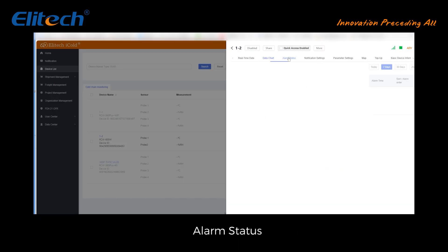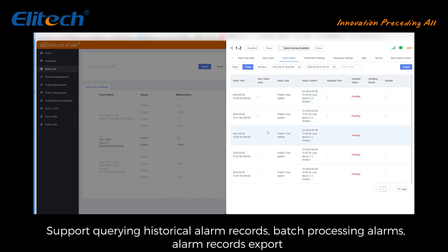Alarm status: supports querying historical alarm records, batch processing alarms, and exporting alarm records.